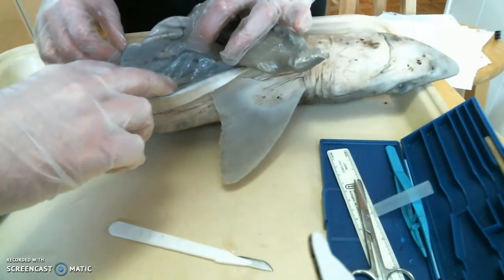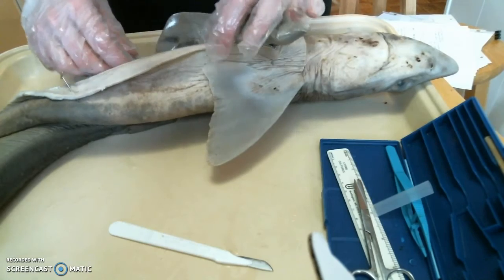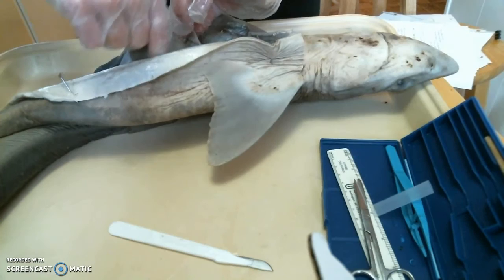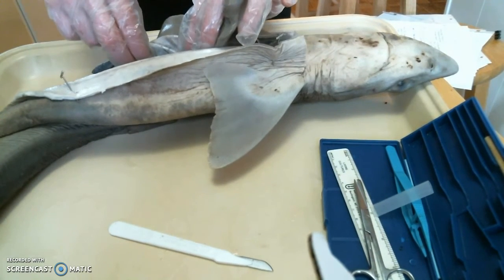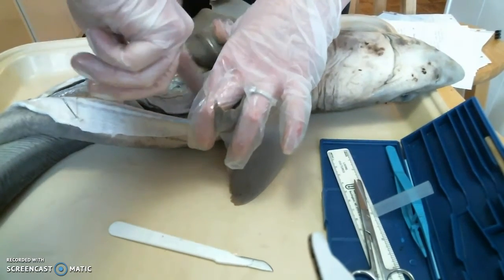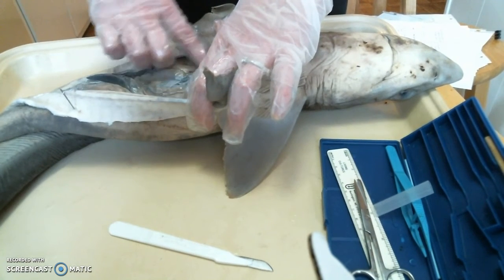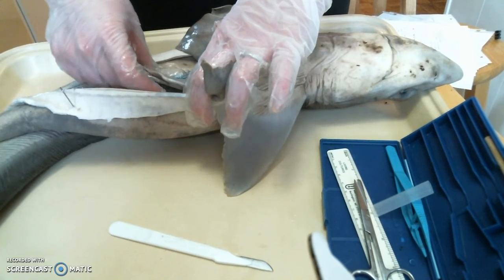And then it connects down to a very thin kind of membrane. And I'm thinking this is the stomach, although it doesn't look full at all. I mean, it looks very flattened. Let's see, esophagus to the stomach. It says the stomach should be J-shaped. That makes sense because this thing here definitely does seem to make a J shape. So I think we have found the esophagus there, the hard thing in the dead center way underneath the livers. And so we have the J-shaped stomach.